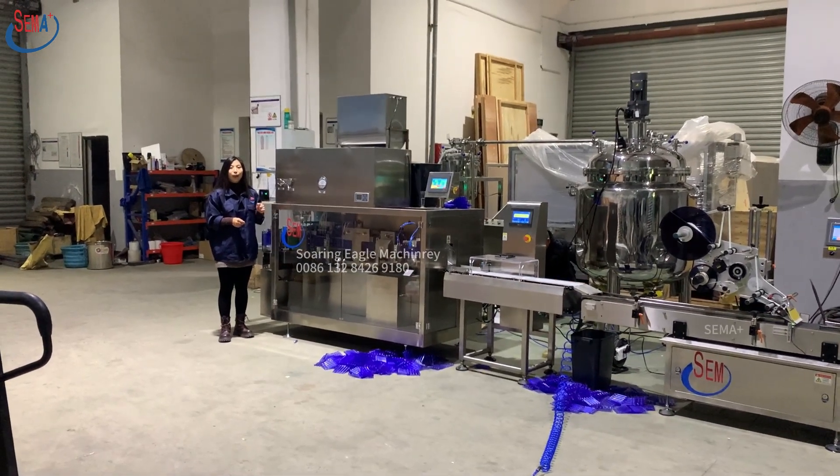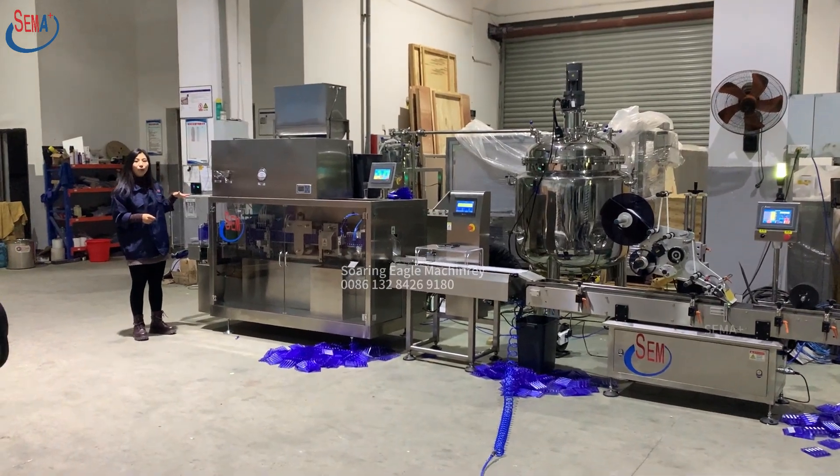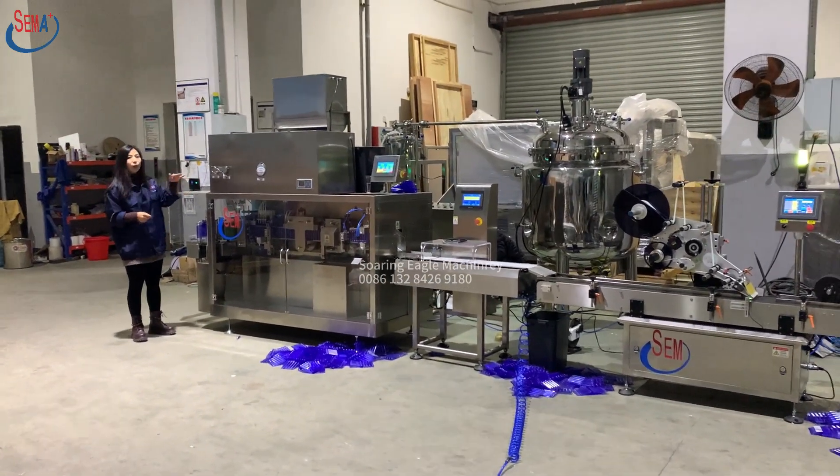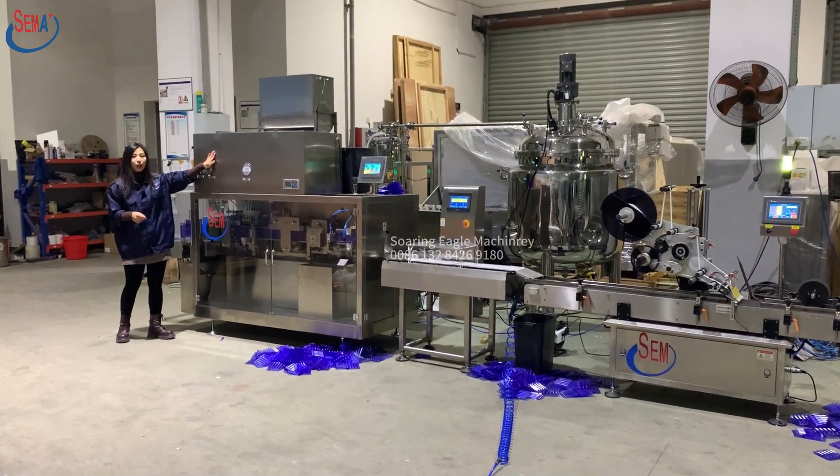This is our liquid packing machine pipeline. This is the found-known liquid packing machine, and it's for food and pharmaceutical product packing.